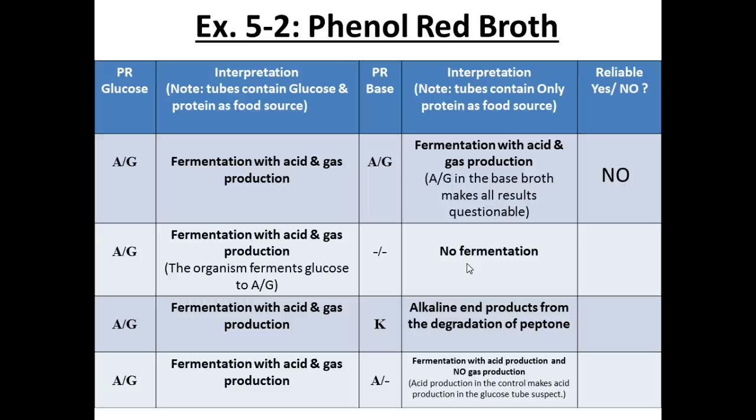In this case, the other thing you want to look for is to make sure that the organism grew. So Shannon asked earlier, what is this gunk in my tube? I'm like, that's your organism growing, right? And so for some of you, you may see some turbidity. Some of these tubes have been going for a while, so the organisms are probably dead, but you might see a collection of them at the bottom of your tube. If you don't see any growth of your organism, then that's why you're not getting any result changes. So it would be a viable result if you are seeing growth in your tube. If you're not seeing growth, you'd repeat this test.